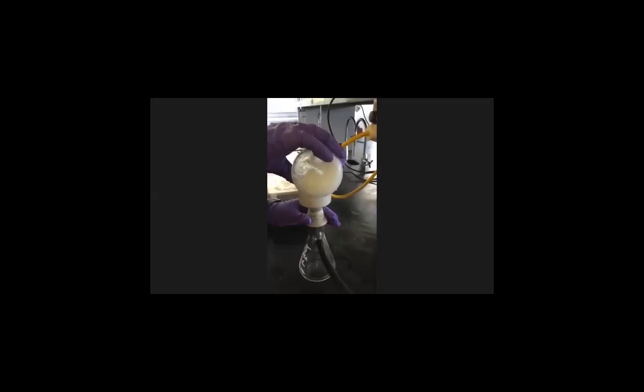And while that water is going, you're just gonna pour that on. And I think don't you have to rinse it twice? 15 or 10 mils? Is it 15 mils twice? 20 mils twice. All right. So go ahead and pour it. Just don't dump it, but just pour it on. And you'll see in the flask, you're gonna see the water start to come through to the bottom, because you're pulling back on it. So get all the solid on there that you can, and anything you can't get, just turn it over and tap it.